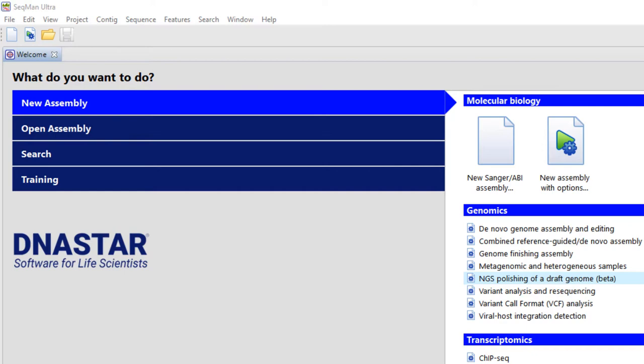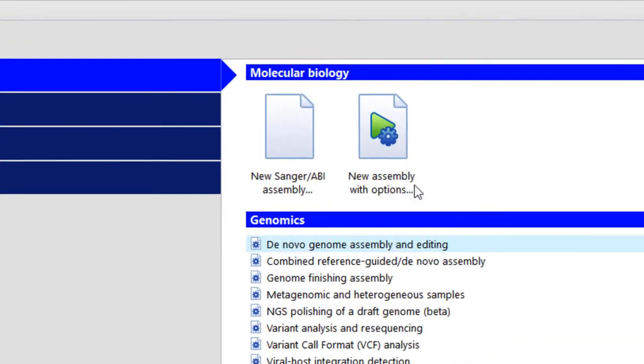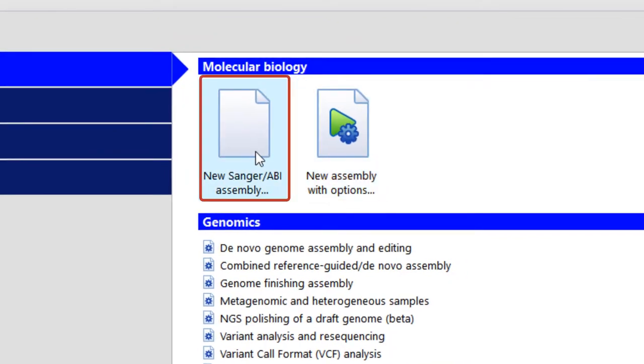To get started, launch SeqMan Ultra. In the New Assembly area, click New Sanger/ABI Assembly.